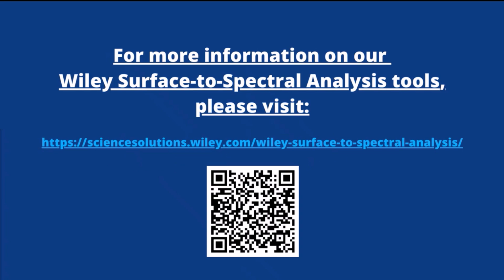There is a chemical cubes add-on. This enables the user to do 3D multi-channel cube generation to depict 2D data that way. There is an SEM add-on for scanning electron microscopy.